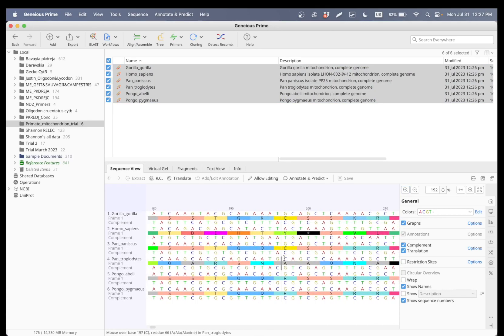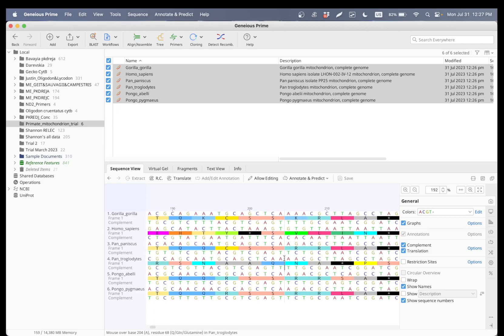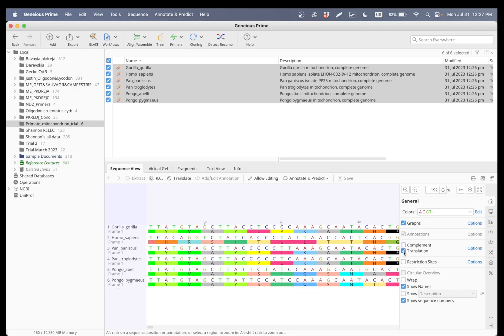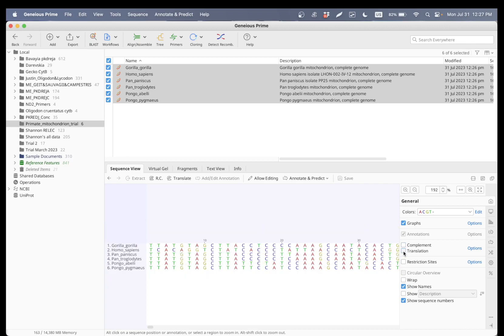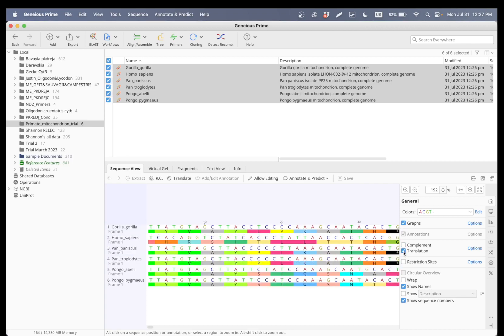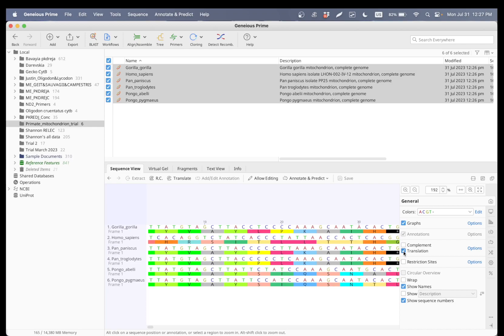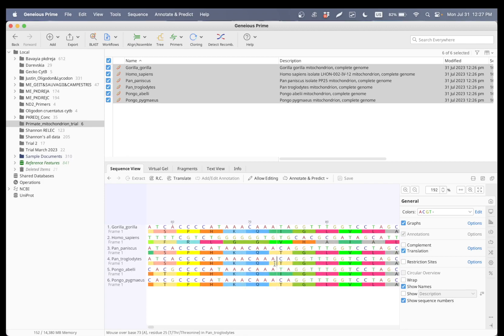A couple of things we need to be looking at first: as you can see the sequences are not aligned yet. The complement is basically reflecting the mRNA sequences — if it's T then it's going to be A. For translation, which shows the amino acids, we keep it visible all the time, because although nucleotides are quite important, amino acids are also very important in terms of sequences.